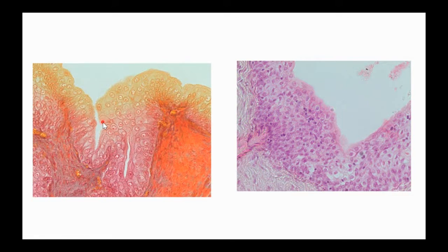When your bladder is full, these are going to squeeze out more or straighten out more so that you have more space for urine. So when you're looking at cells that are arranged all kinds of funky, look at all this mess inside here. Who even knows what's happening? I look here at the top and it's kind of bouncing up and down. We got kind of a cloud puffy appearance down here. What we're looking at would be transitional epithelium.